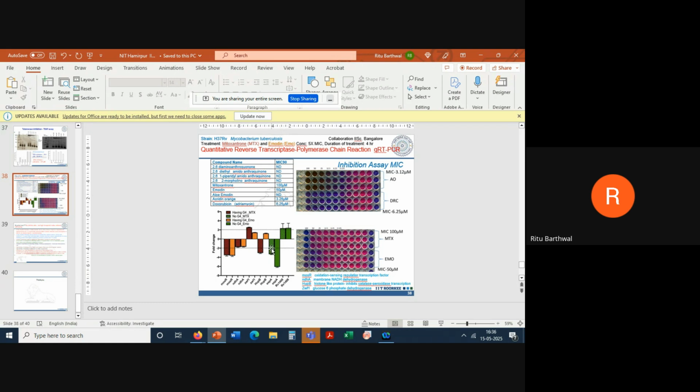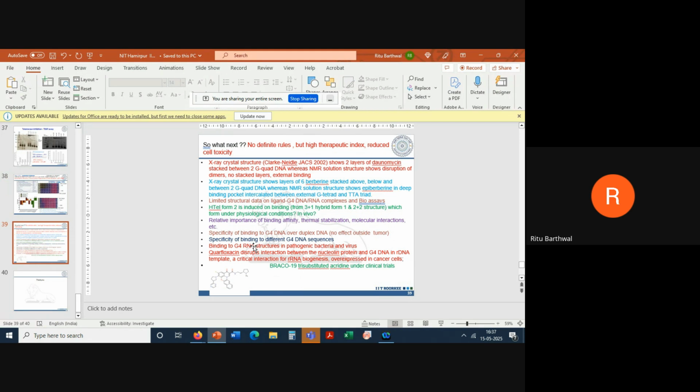If it is negative beyond -2, it is considered quite good. If you ask the bacteria people, they will tell you that a two-fold change is quite good. We got a three-fold change and more than a four-fold change in some cases. And we found that it was stopping the transcription activity. We did CD spectra and so on. We did not do NMR. We have already published these two papers also. So what I'm trying to tell you is what all can be done.